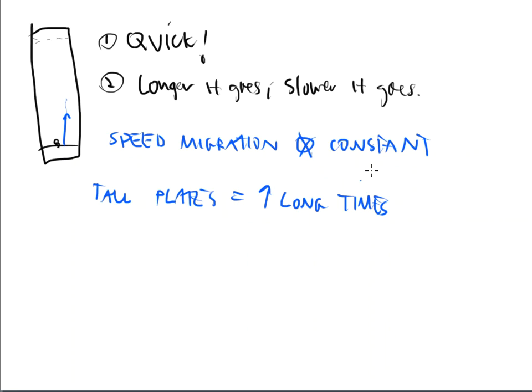So it's better for me to choose shorter plates instead. That's just a phenomenon that we see in TLC. The reasoning behind it is contributed to 4 or 5 different things. Gravity can actually be one of them. And we don't really talk about it any more than that. So it's just something that we go into the process knowing that if we have really tall plates, if we have very large plates, you're going to be there for a while.